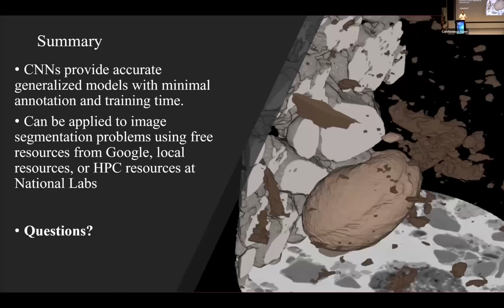Thank you, wonderful talk. I'm excited about segmentation, which we used to do manually, of course. So tell me about the statistical significance. I admire your grape seed and how quickly you do these things. What do you consider before you make a hypothesis and confirmation of it? How many seeds do you think you would have to process in order to get an idea?